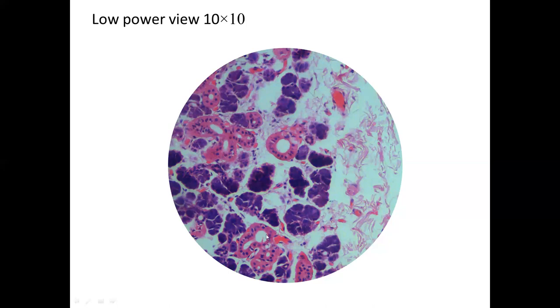You can vaguely make out the central nuclei of the acini. The ducts are stained nicely pink in eosin, with clearly visible purple-stained nuclei in the middle. The lumen is in the center, the cytoplasm is pink, and the nuclei are visible so you can imagine where the cell margins are. Between those structures, you can see small lines stained in pink — these are collagen fibers.